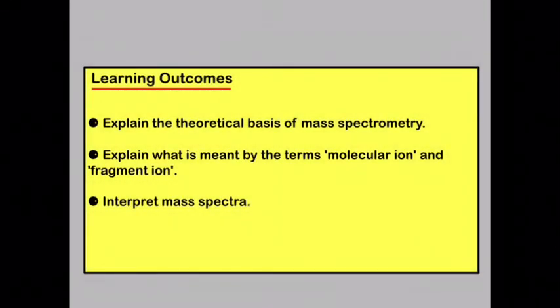The learning outcomes for this lecture were firstly to explain the theoretical basis of mass spectrometry, secondly to explain what is meant by the terms molecular ion and fragment ion, and thirdly to interpret mass spectra.